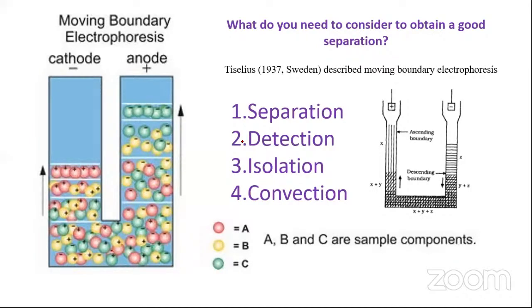Sir, maybe if the positive and negative electrodes are not on two arms of the U-tube, and maybe within one arm. Maybe it's not a U-tube, just a straight linear chamber. Okay.